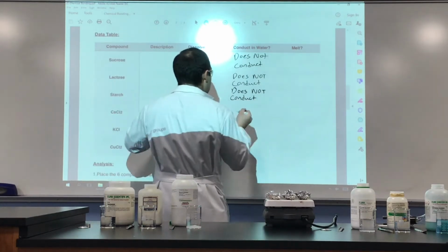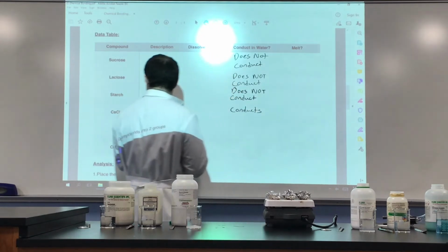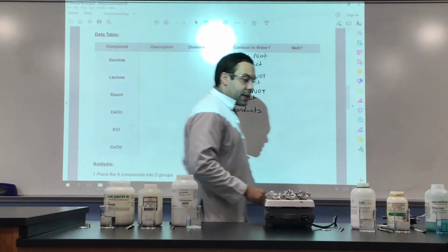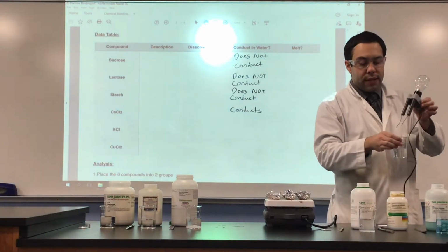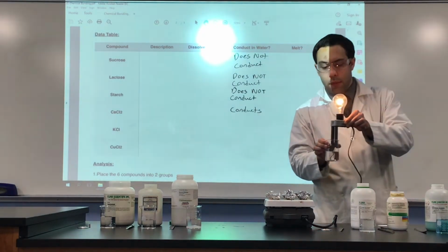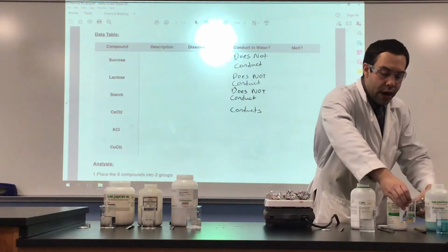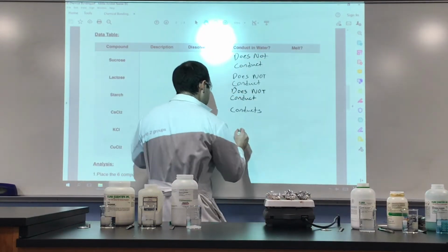I'm just going to put conducts. Potassium chloride is next, KCl. Take the electrode, place it in solution. The light bulb goes on. So the potassium chloride also does conduct electricity. So we'll put conducts.